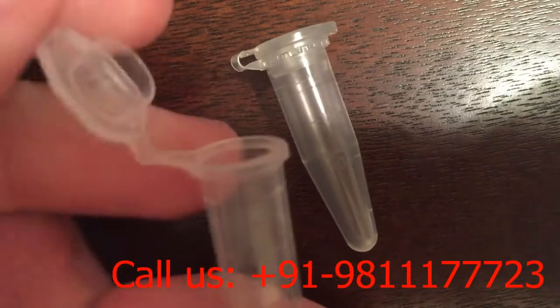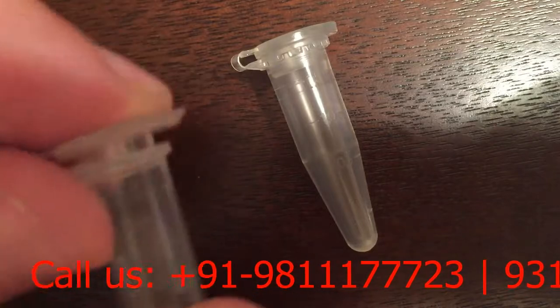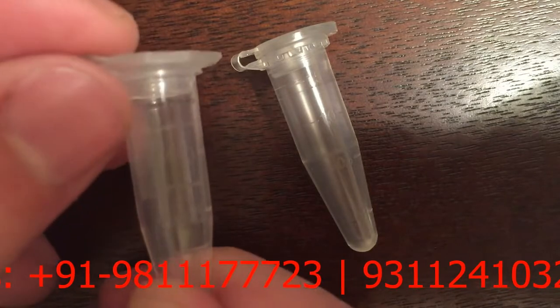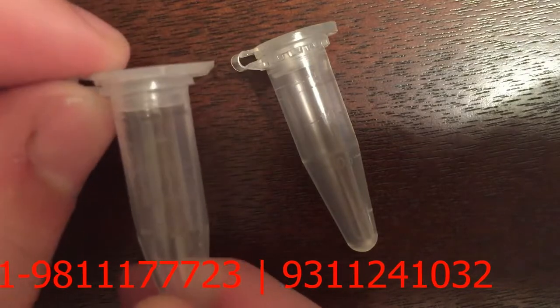As tubes are opened and closed, you'll notice that fingers and gloves are going to get all over it, and depending on the way they're handled, it can be a serious source of contamination. If you have a sensitive sample that you don't want contaminated, make sure that you have enough room so that it's not coming into contact with the cap.